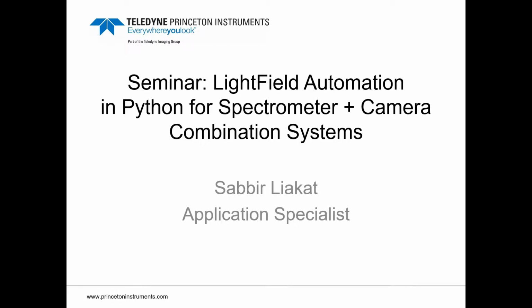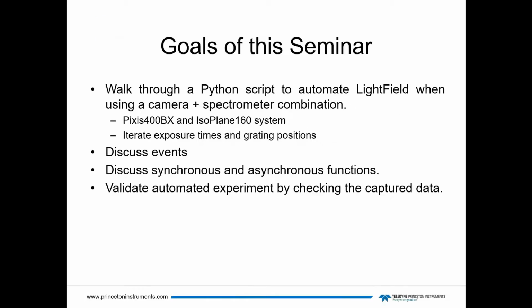A prerequisite, if you will, to this video is the first seminar I did on the introduction of the LightField automation interface via Python. It's highly recommended that you watch that video first, as it'll give you a good idea how to get acclimated into the development environment and how to automate LightField using Python.